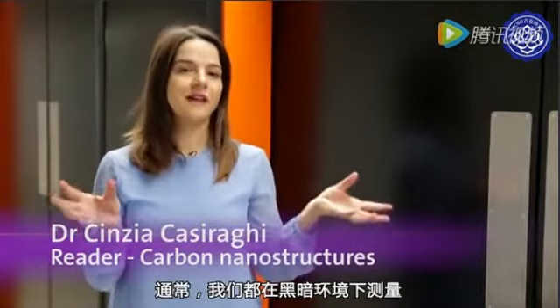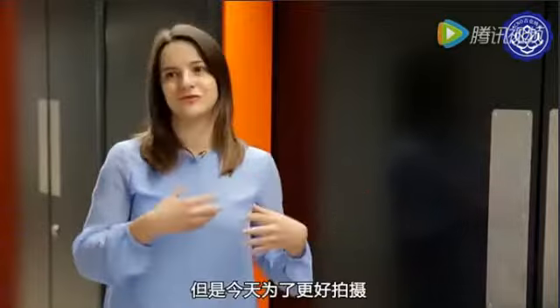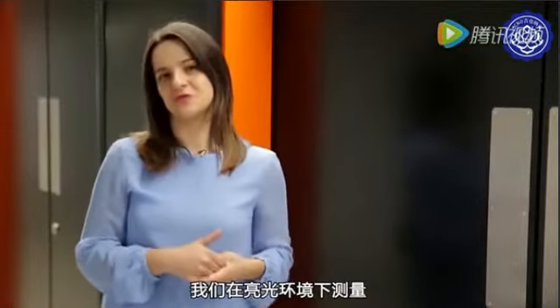Usually we measure in the dark because the detector is very sensitive, but today, just to make things easy for the camera, we are going to do the measurements with the light.